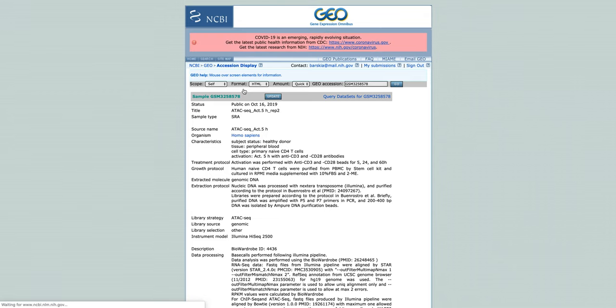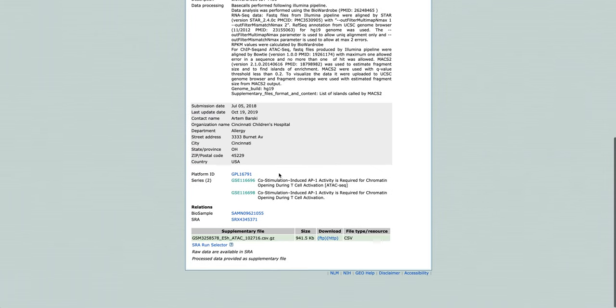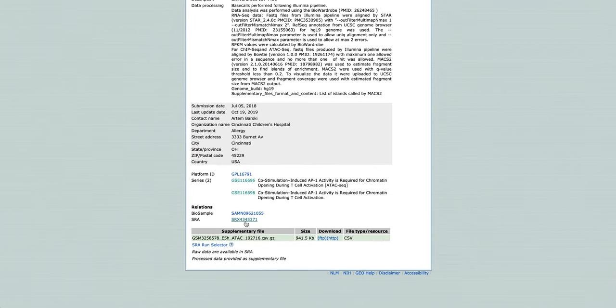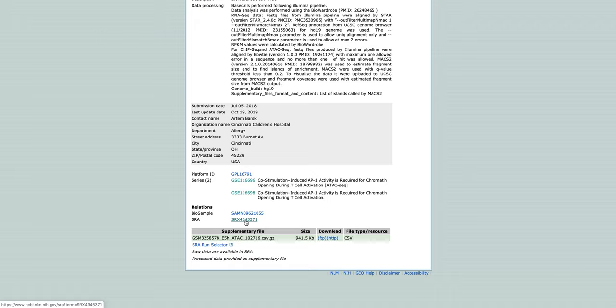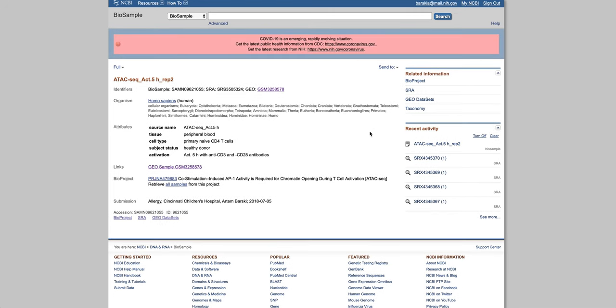So we go here. This is the GSM sample record for the experiment. We can click on either SRA link, or sometimes there is no SRA link, so we click on this biosample link. And from here, we can go into SRA.